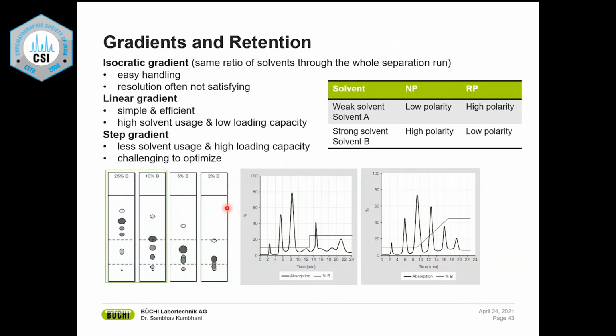Like, for example, in this case, when it was a clear step gradient, this 6-compound mixture wasn't really well separated. But when I mixed a linear and a step gradient together, they got really well separated. So playing with your gradient will really help you improve your separation also.